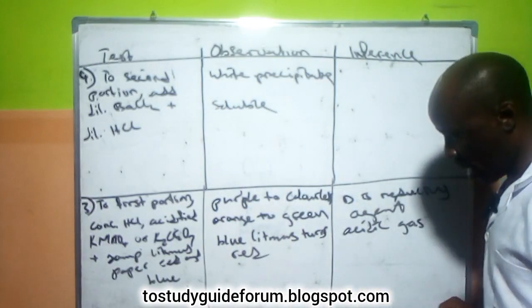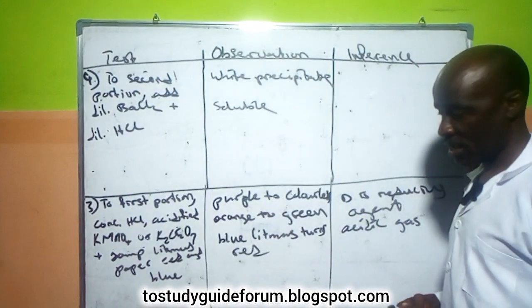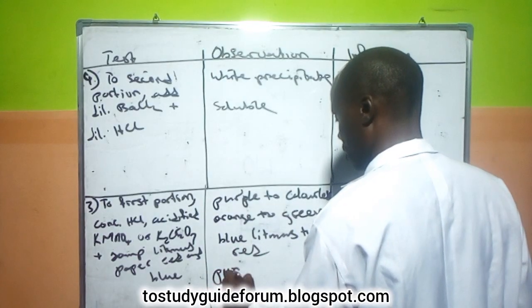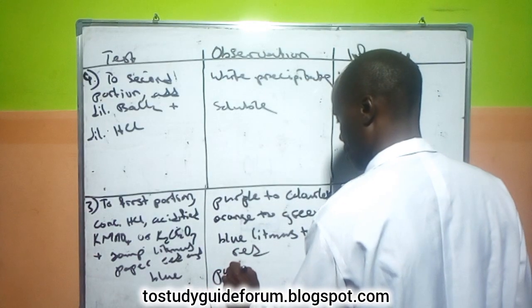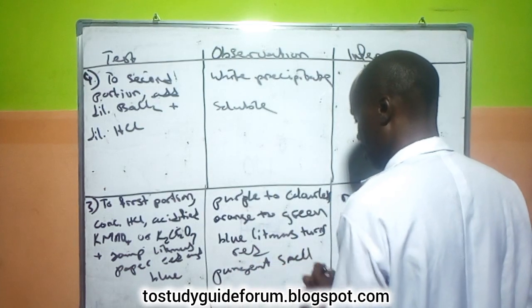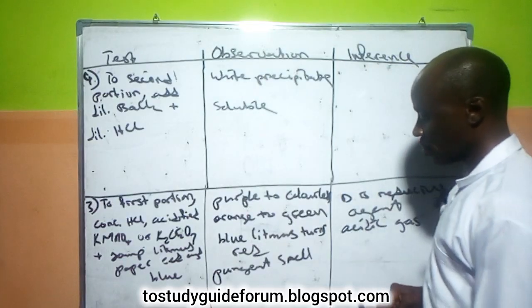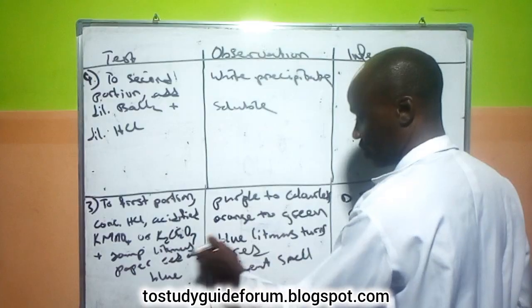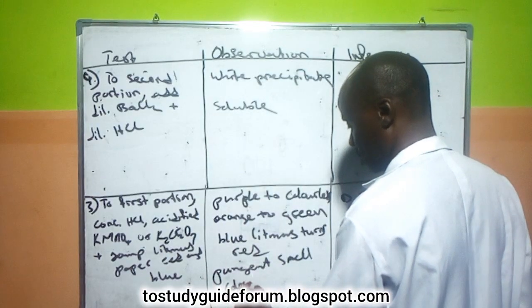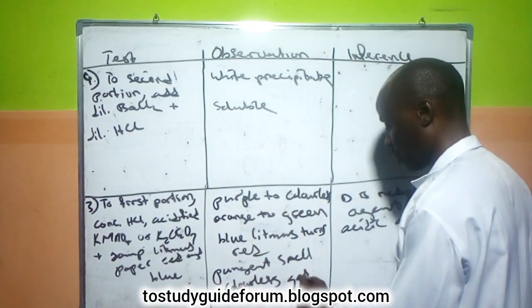Now there's something I did not tell you here. When this gas is coming out, it always has a kind of pungent smell. Actually, it smells like burning matches. The smell of this gas is pungent, and it's also colorless. Colorless, I did not indicate that. Colorless gas.